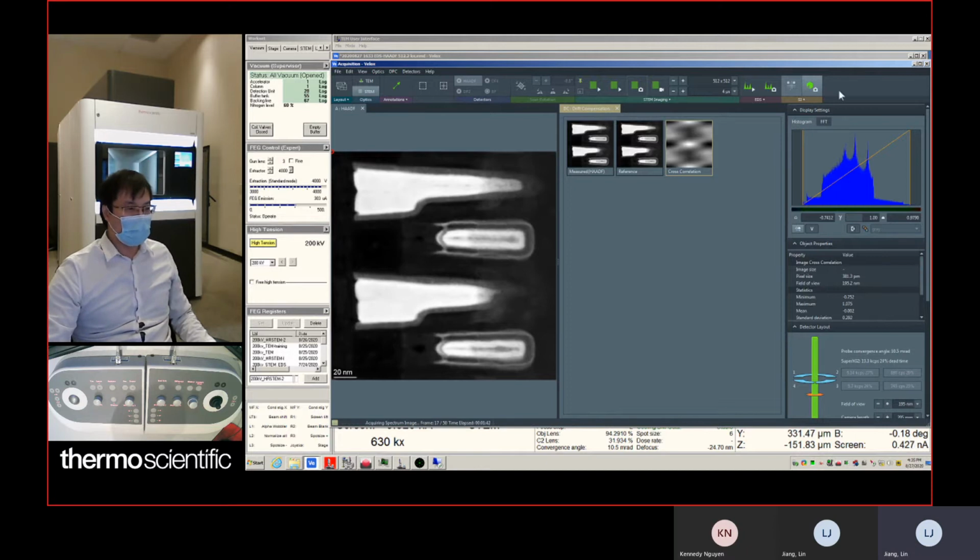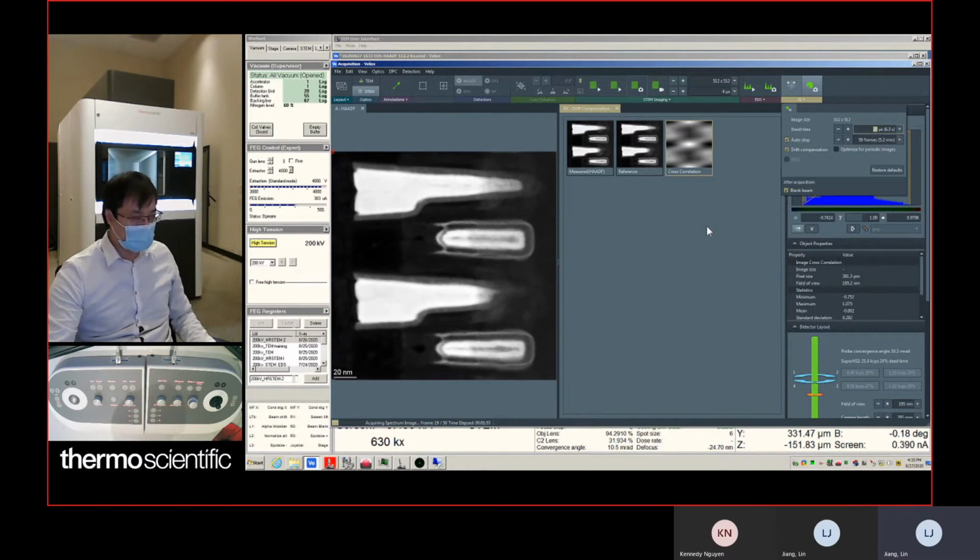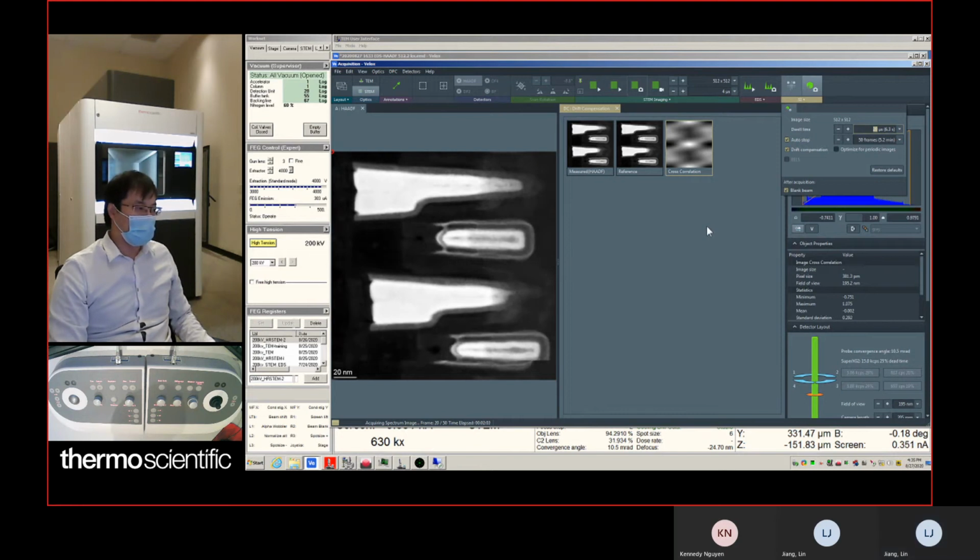But just now, with 2 microsecond dwell time, the frame time is 0.36 seconds. If I move now, it only takes up to 0.63 seconds to bring it back. So I can move again to the right, and now it's back.